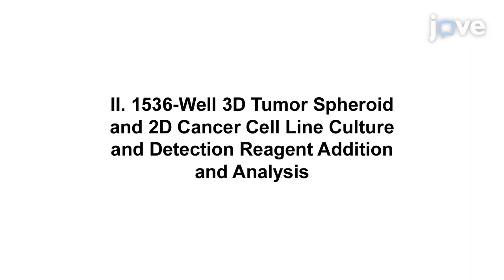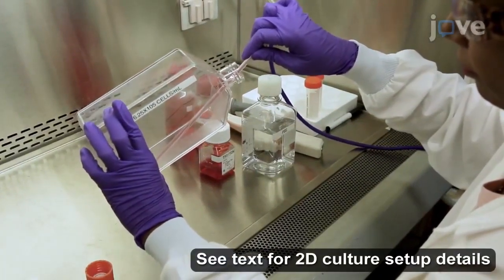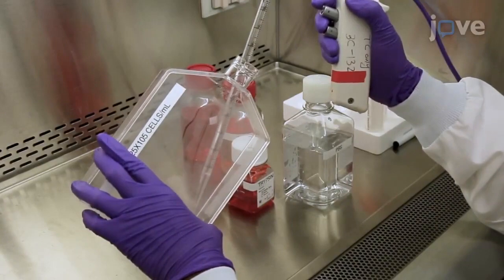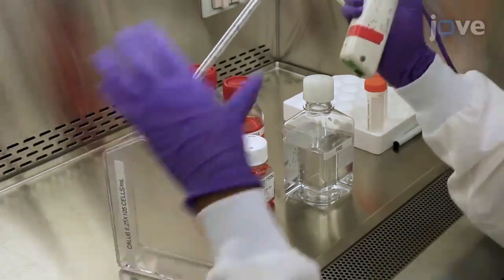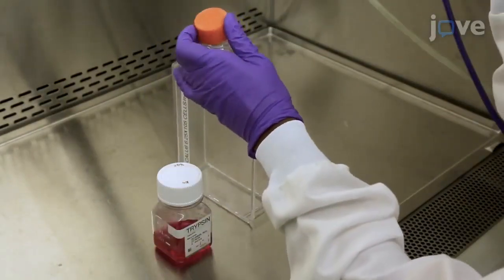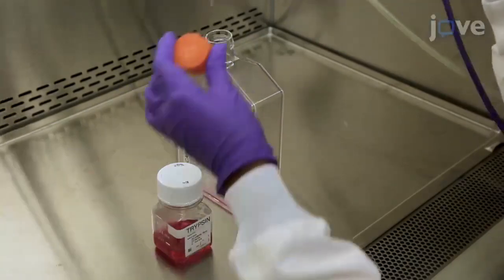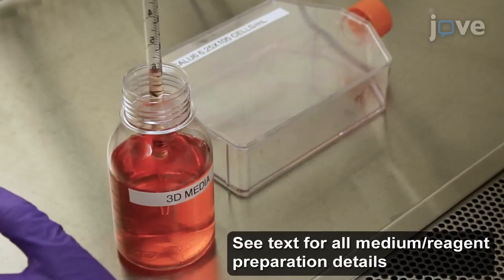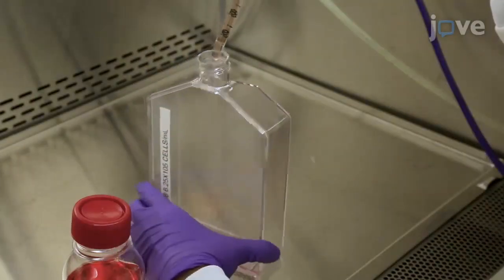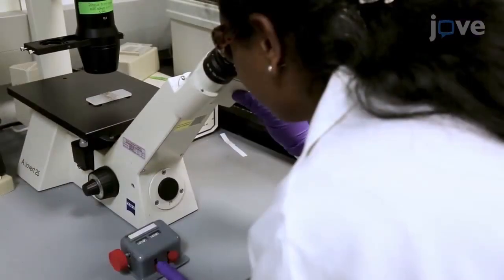Demonstrating this protocol will be Kalyani Gampa, a senior scientist from my lab. To set up a 3D tumor spheroid culture, detach the cancer cell lines of interest with three washes of PBS, followed by the addition of one milliliter of trypsin per five centimeters squared area of culture flask. After five minutes, neutralize the trypsin with five times the volume of serum-supplemented medium in each flask and count the cells.